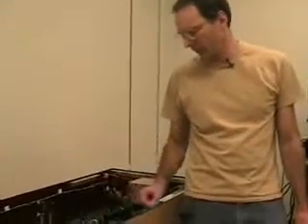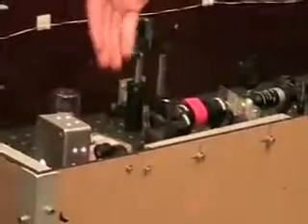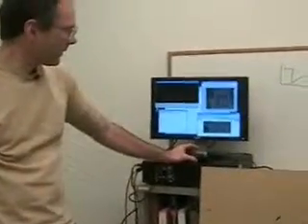Now what I'm going to do is put in some of the filters to make things even dimmer, and I'll let you figure out some of the other things that are happening in this experiment. That's part of what you're doing in the lab. But I'm going to put in the excitation filter and the emission filter. And again, you'll see things have gone completely black again. So what I want to do at this point is make sure that I've got as much light as possible. So I'm going to turn down the neutral densities all the way to 0. I have no gray filters in, but things are still black. So I'm going to come over here, and you see the crosshairs.